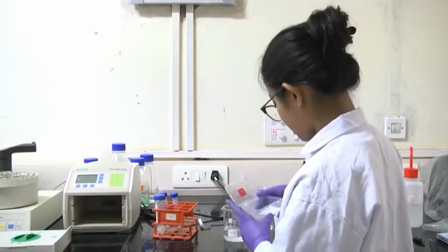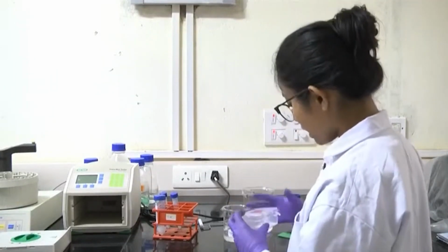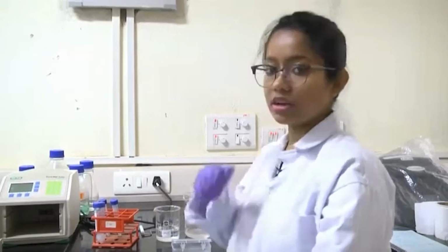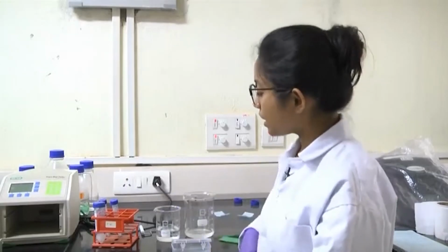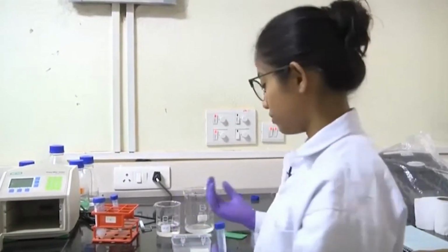Now, I will put the primary antibody. The primary antibody is raised against the protein which I want to detect, and this is also dissolved in TBST buffer, the same buffer which we are using here. Depending on the specificity, you have to check the amount of primary antibody you need to provide.